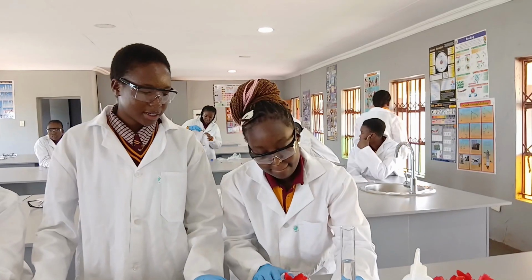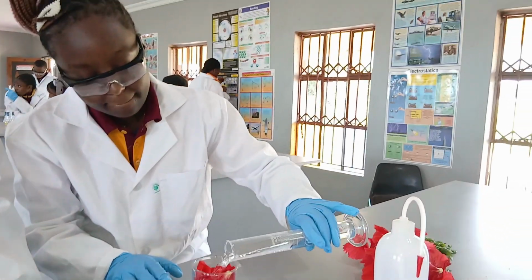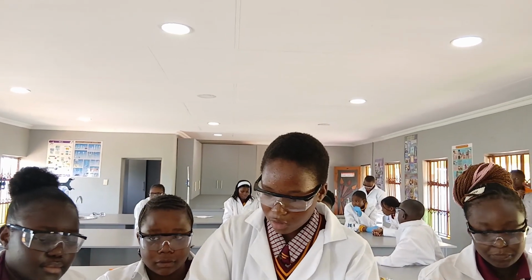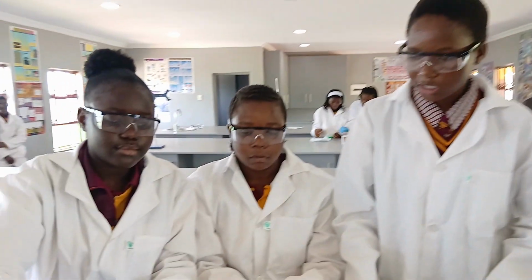Then we're going to pour it into our pan. Now we're going to make our own fire using our spirit burner, whereby we're going to pour our spirit into our spirit burner.